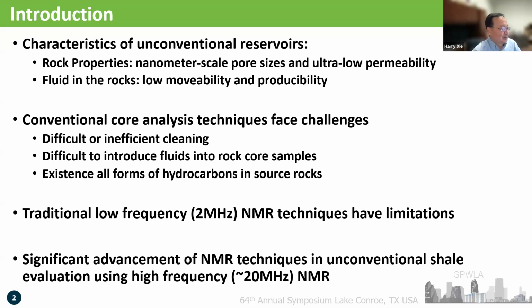Some of you may have done NMR measurements before. You do conventional NMR core analysis, but when we apply the same technology or techniques to unconventional rocks, we have some difficulties or challenges. For example, it's very difficult to clean the sample. We all know that. Two parts: pore size too small, and permeability too low. So if it's not impossible, it's going to be very difficult, and it's going to take a long time to clean the sample.